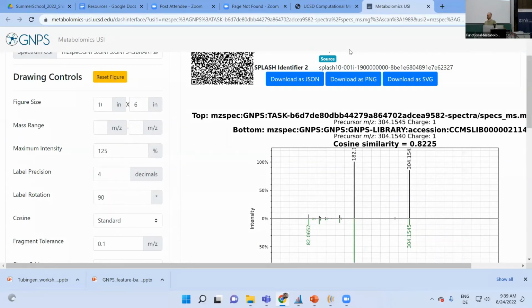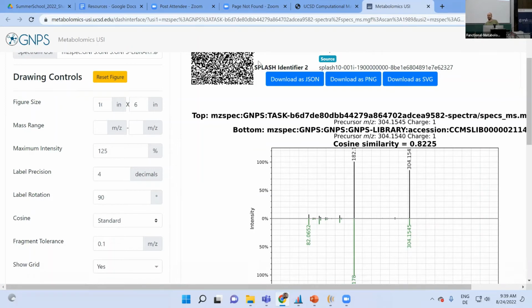And that's another thing that is under the hood there, hidden in some of the advanced features, and that is filtering of the spectra. Especially if you have instruments that produce more noisy spectra, then for calculating cosine, those small noise peaks are a little bit annoying. So they use a shifted window in 50 m/z units and remove all the low abundant peaks there. If I turn this off, then I think it should show you the same value. And actually that is something that you might want to try.